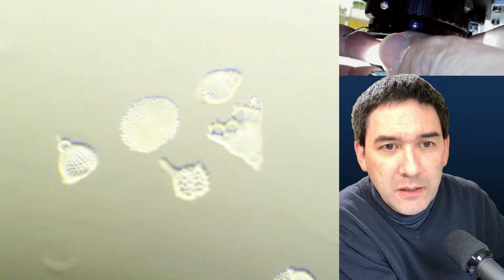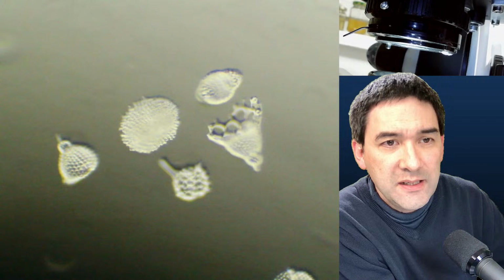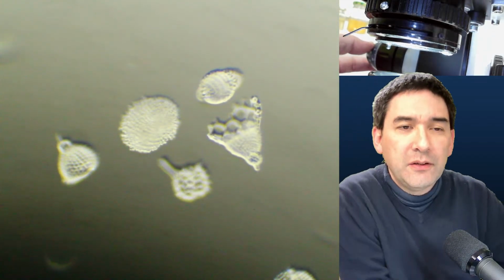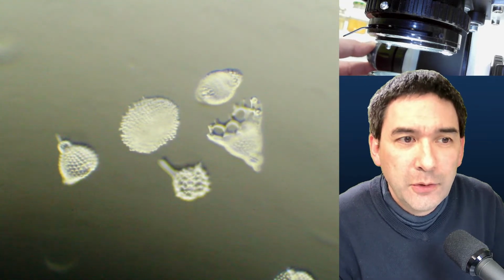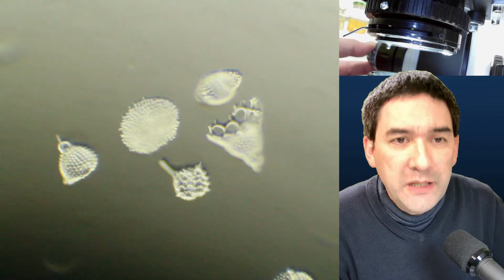Of course, it becomes very bright. So I might want to turn down the light intensity a little bit. I can refocus a little bit. But you might now see that the shape looks a little bit different, right? It looks like there is a little bit of a shadow. It looks a little bit three-dimensional. And this is referred to as oblique illumination.